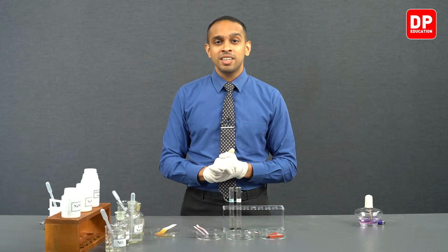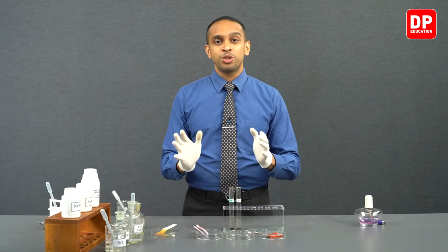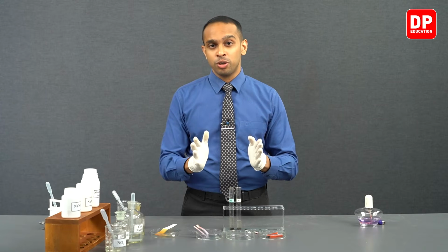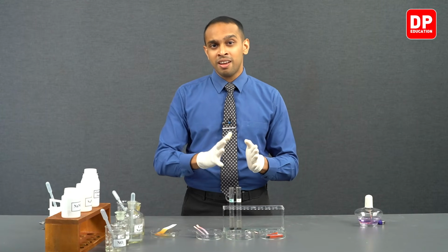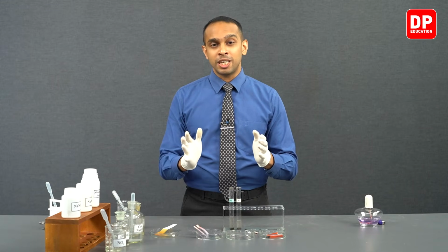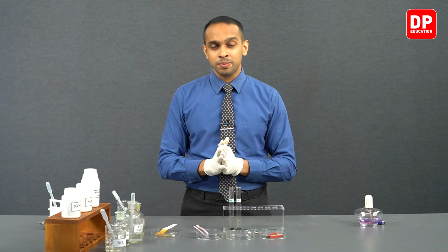And then we conducted a very specific test for nitrate ions, which is known as the brown ring test. In this test, we made a fresh solution of Fe2+ aqueous solution and then reacted it with NO3- or nitrate ions.